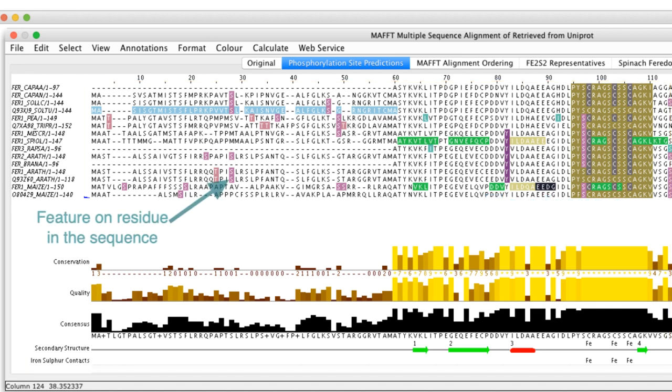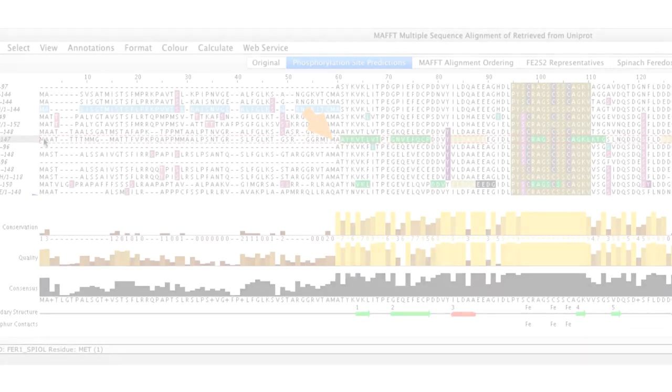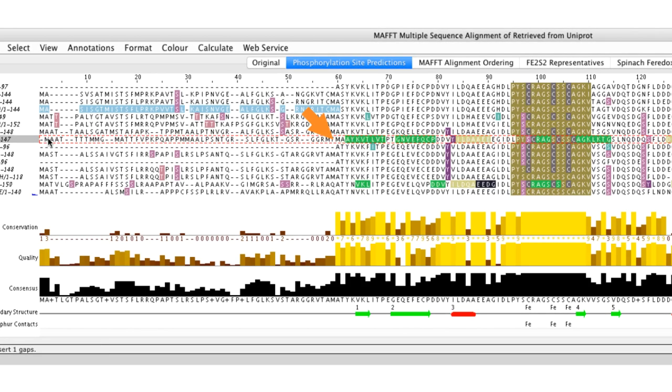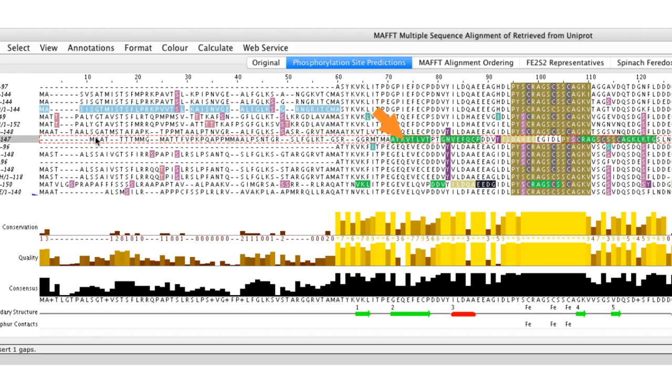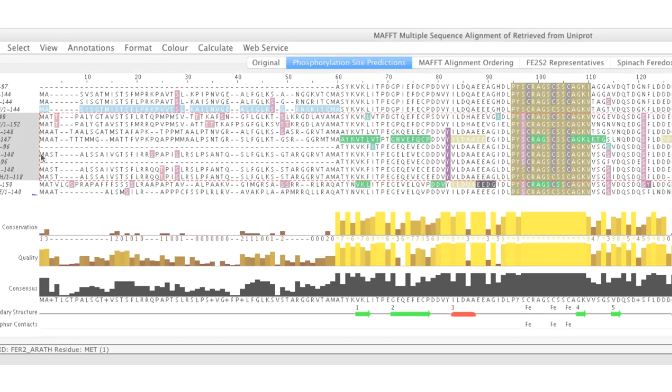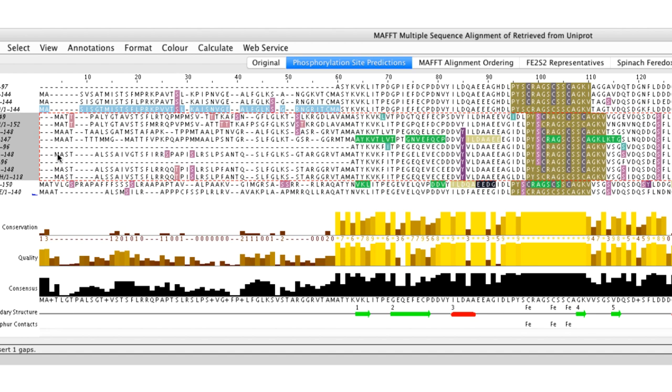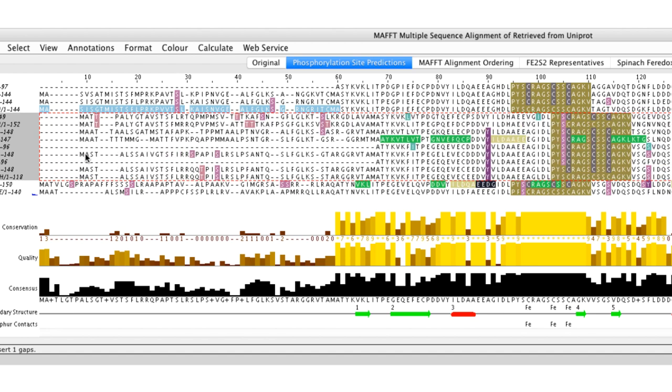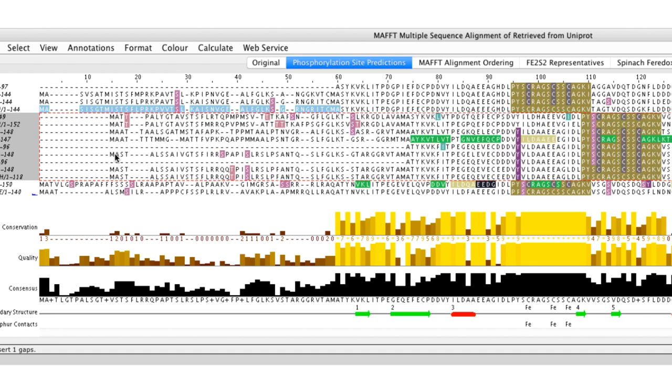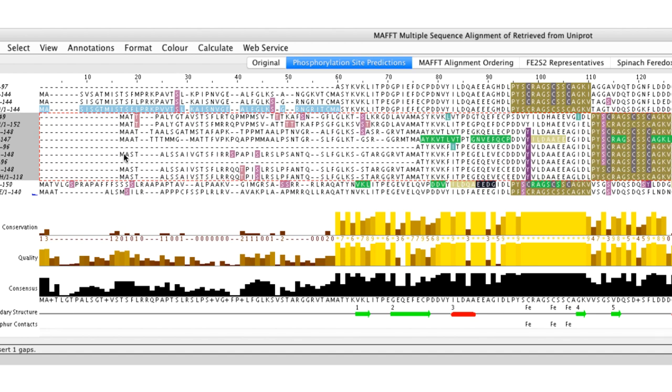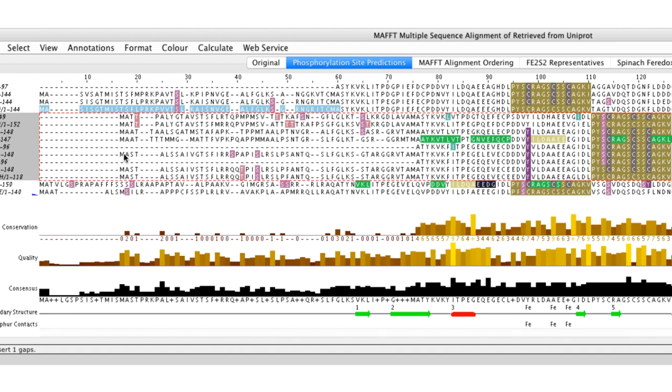Generally speaking, features are associated with specific residues in the sequence and are superimposed onto the alignment, so they do not change their position on the residue if the alignment changes. In contrast, these annotation rows are dynamic, so if the alignment changes, then the annotation rows automatically recalculate.